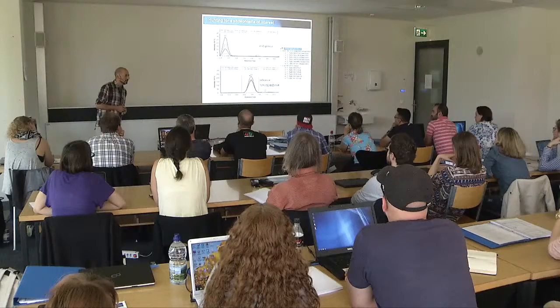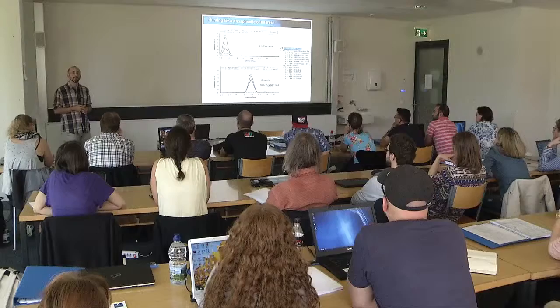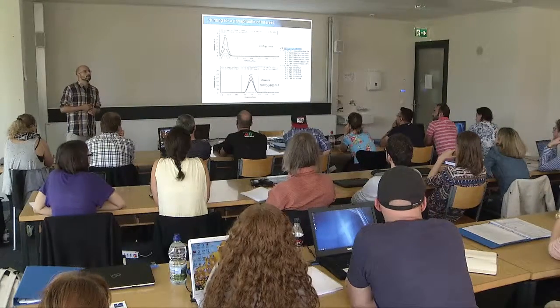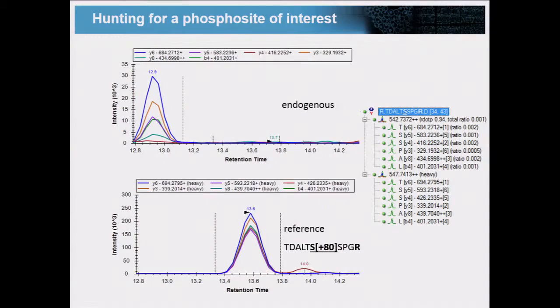The naked peptide, the endogenous peptide, is not phosphorylated. Okay? Any other suggestions? You say here there's a different background. Okay, but this was spiked in the same background. So these were separated. I showed you how to do this split window. So they come from the same measurement.